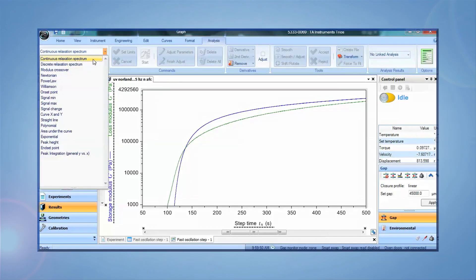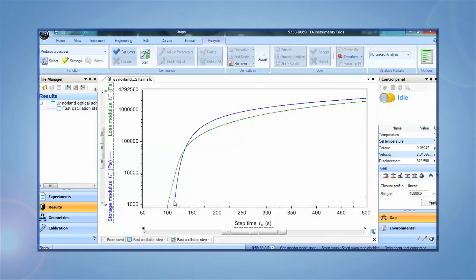The experiment is complete. From this graphic, we can obtain the gel time, pot life, viscoelastic properties, and even the shrinkage of the sample when we control the normal force.